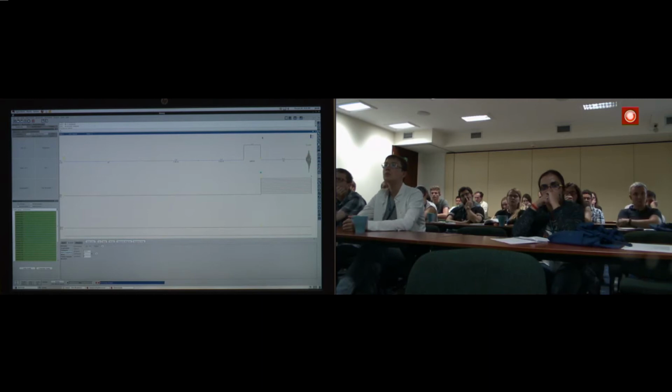We have an excitation pulse on carbon-13, but just right after this excitation pulse, we apply a train of pi pulses with different phases on the proton channel, and that gives us an extra heteronuclear decoupling, because we somehow saturate the proton reservoir, and in that way we reduce quite substantially the heteronuclear dipolar coupling between the protons and carbons.